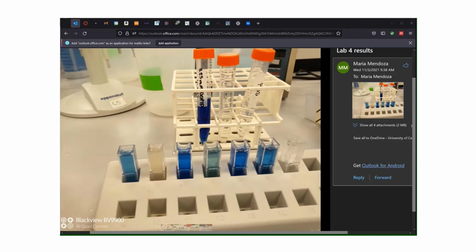So if you hypothesized that you would find most of it in the mitochondria, or the mitochondrial fraction, then our hypothesis would be incorrect here. So the one that went really clear was the nuclear fraction. So we're seeing the most succinate dehydrogenase activity in the nuclear fraction.